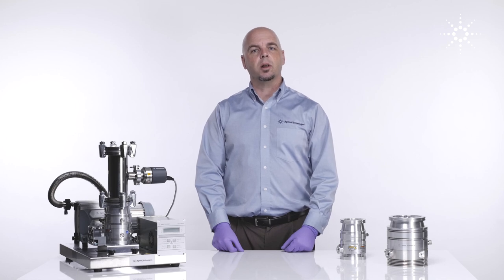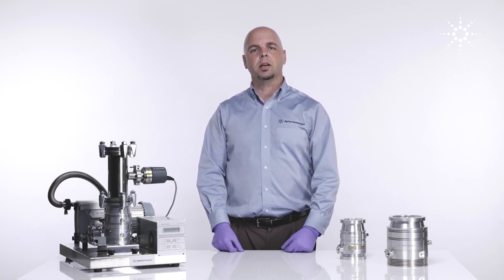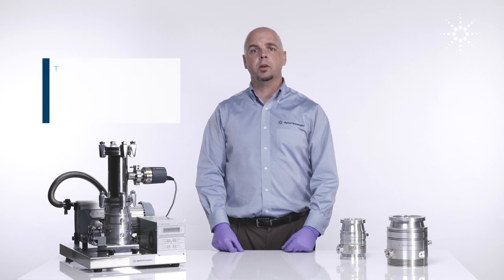Hello, everyone. My name is Bartley Carlson. I work with Agilent Technologies Vacuum Products Division. We're here today to give you an overview of the modern-day Agilent Turbomolecular Pump.